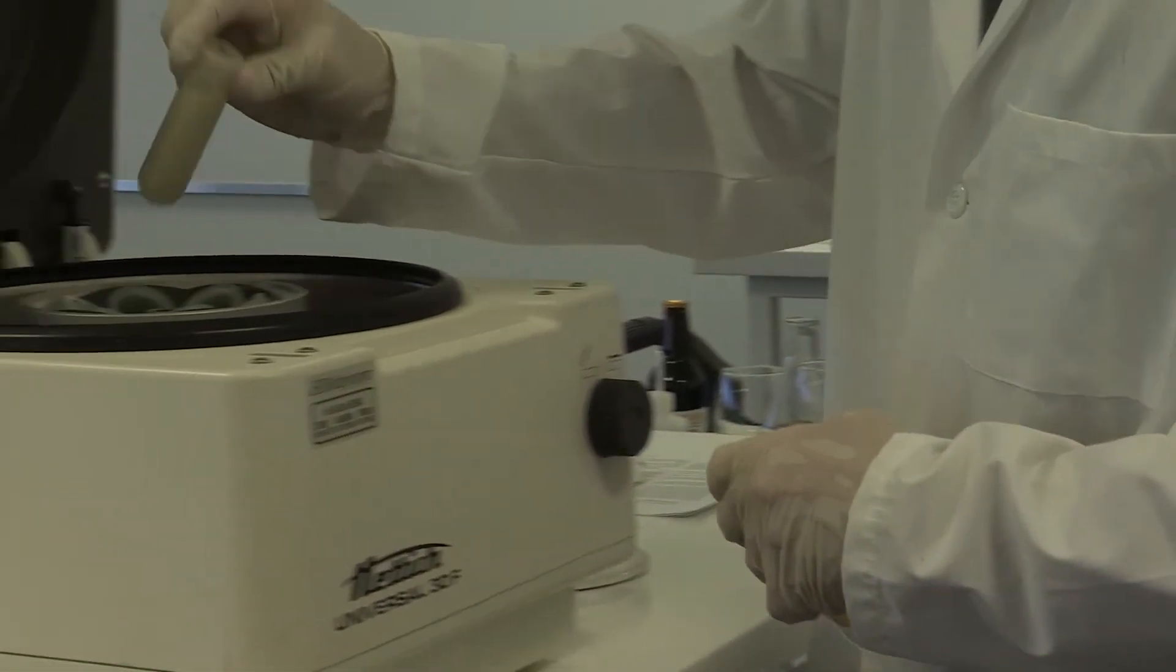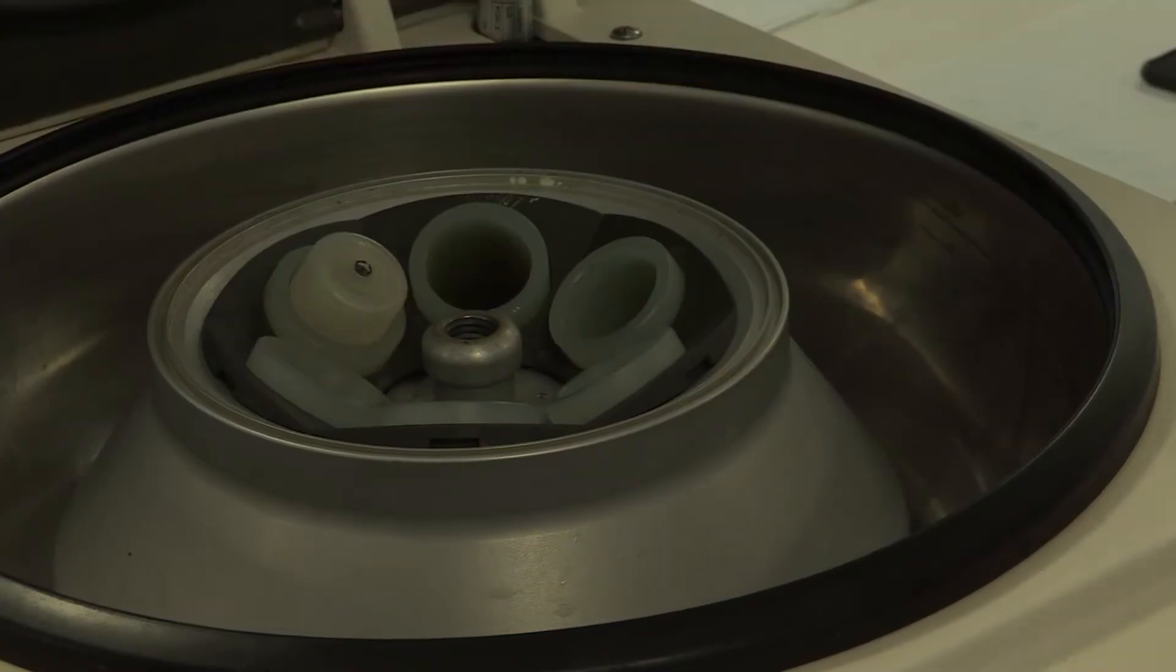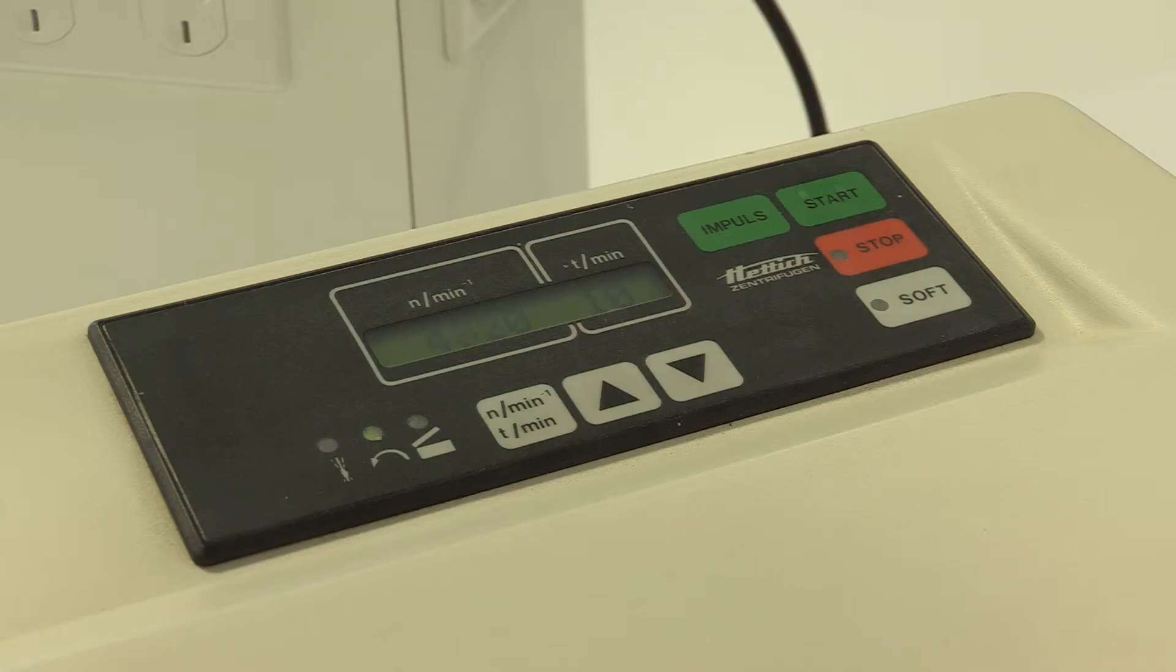After the extraction, the sample is usually centrifuged to separate the phases, and we take the top iso-octane phase.